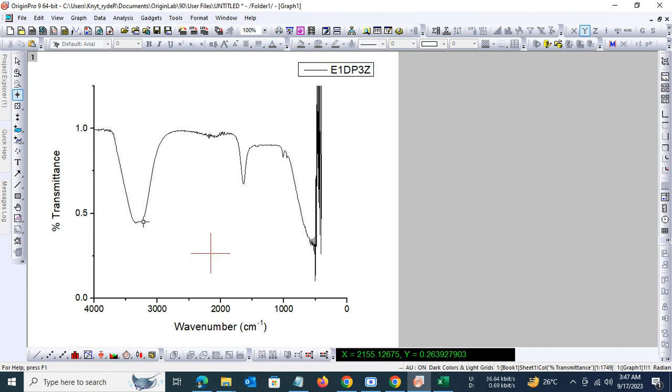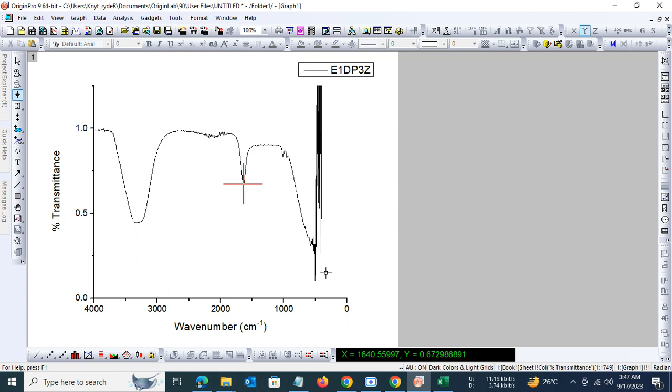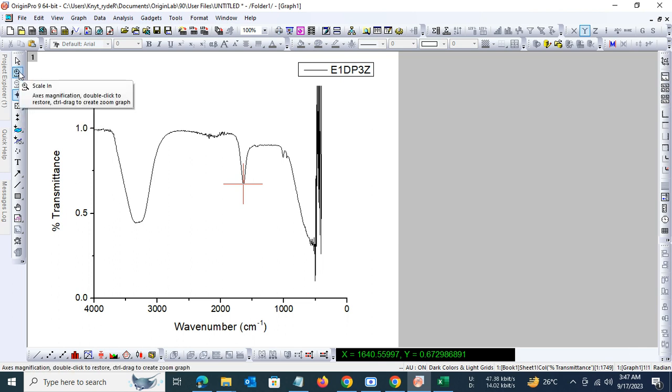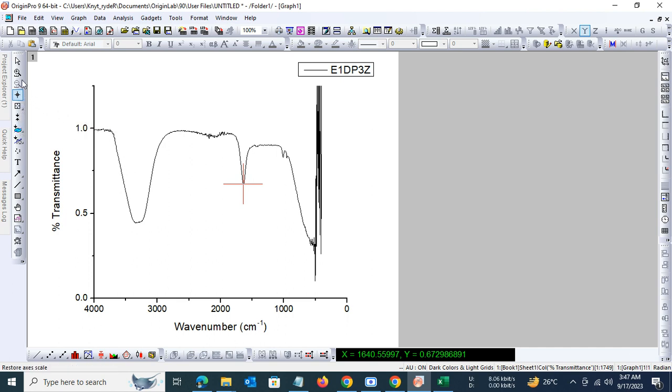So the compound either has a carboxylic group or probably a hydroxyl group. We don't know for sure. There is another peak at 1632, so probably that is due to a carbonyl group. The analysis is a complex process and involves other methods of analysis also to be sure.